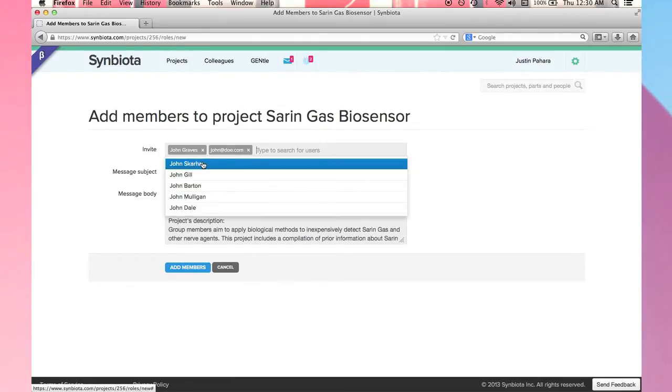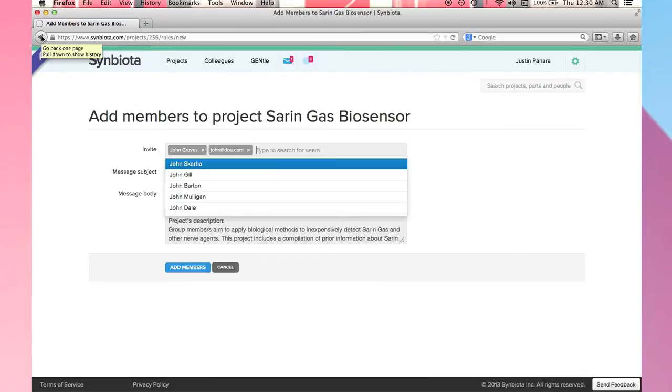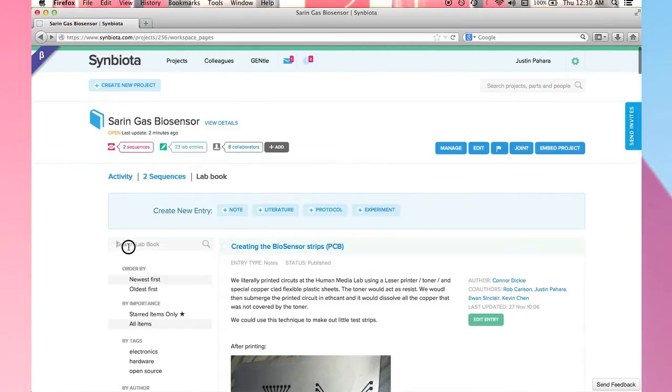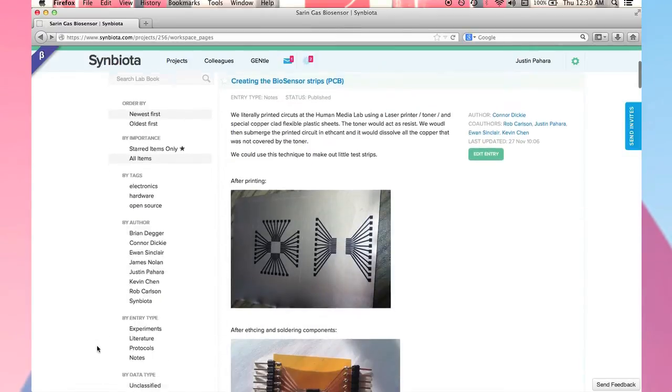Moving back to the lab book, I can search through existing entries using text search or order by importance, by tags, contributor, entry type, or even data type.